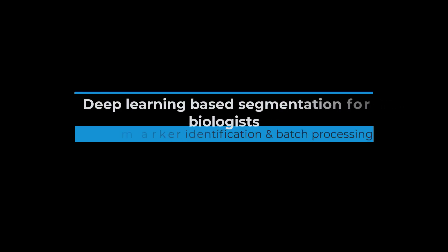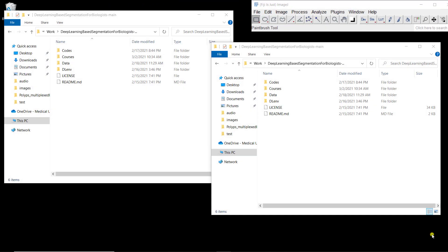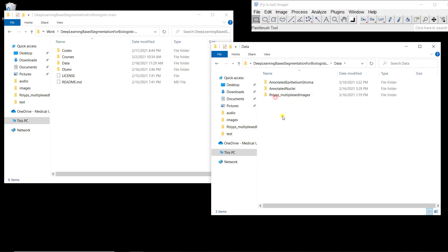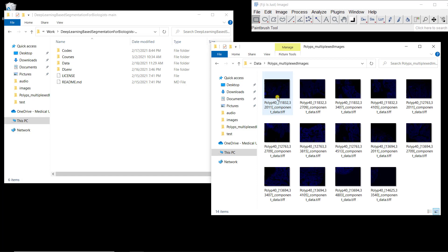In this video I'm going to show you how you can use Annotator to identify markers associated with cells. Before starting Annotator, let's have a look at the data. If we go back to the folder downloaded from GitHub, go to the data folder, there are two folders we used for training. The last one is entitled 'polyps multiplexed images' and it contains 14 images that we want to process.